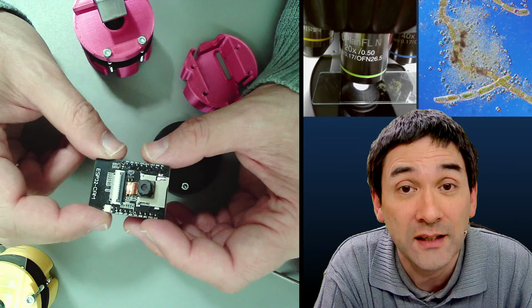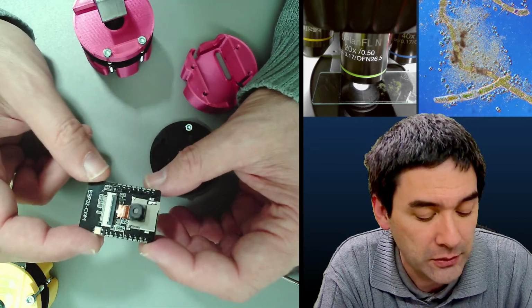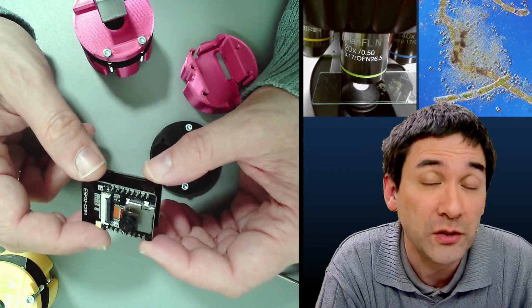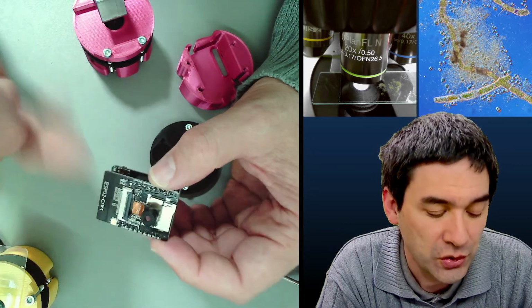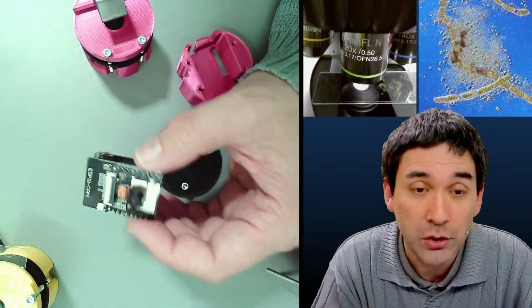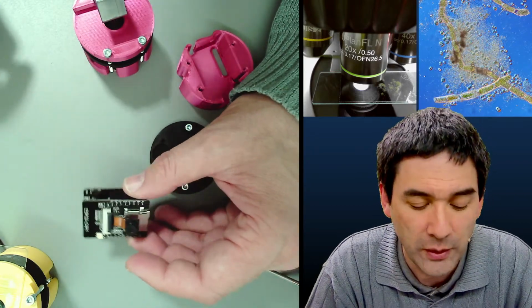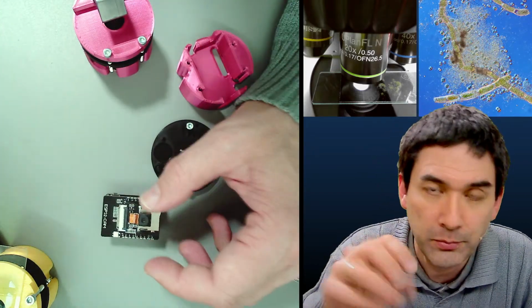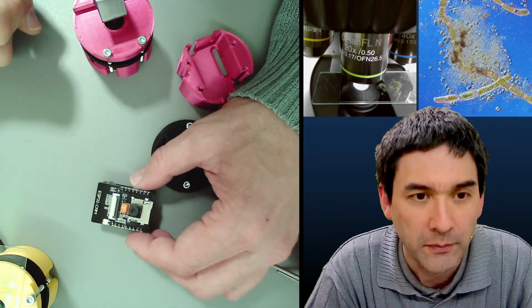And I've tried this, and the image quality is significantly better, even, because we're actually using the optics of the microscope to magnify, and you're just using this lens over here just to create the image. So the image, by actually pointing it to a microscope, is quite good. It's almost like when connecting a mobile phone. A mobile phone camera is also quite sharp.